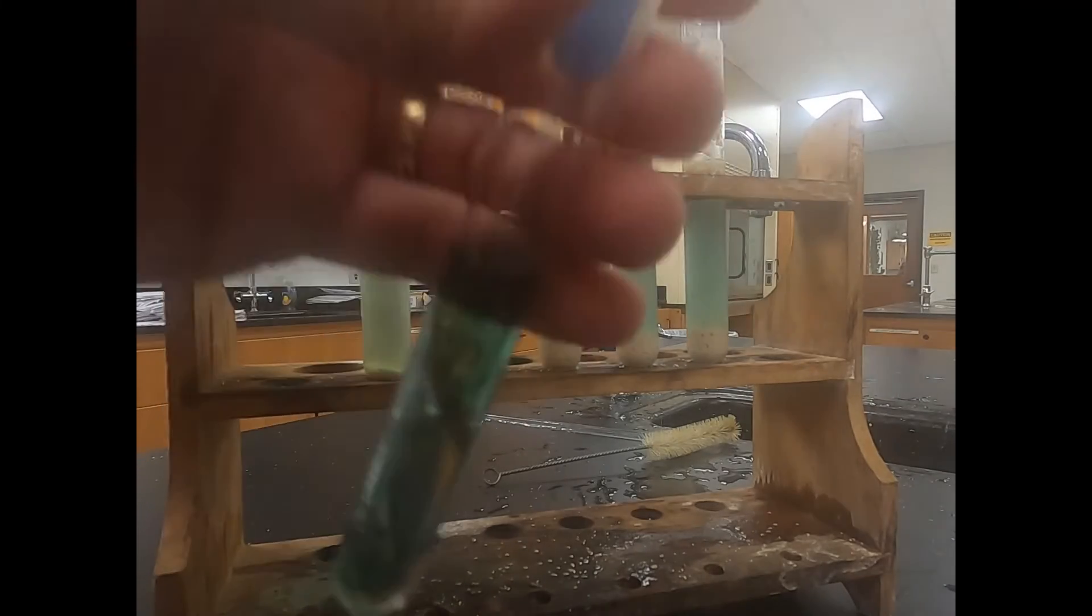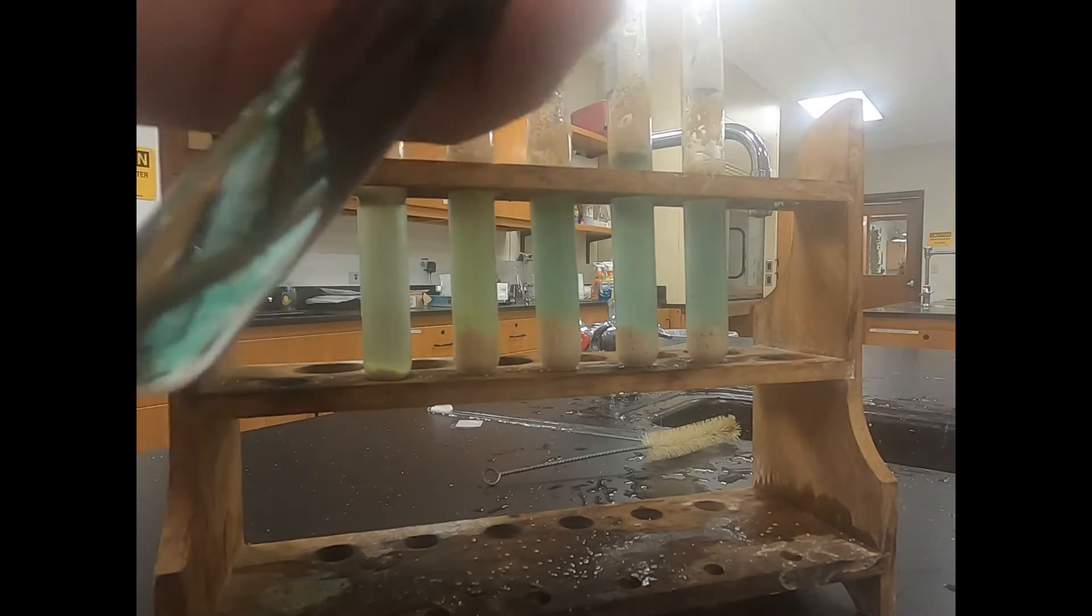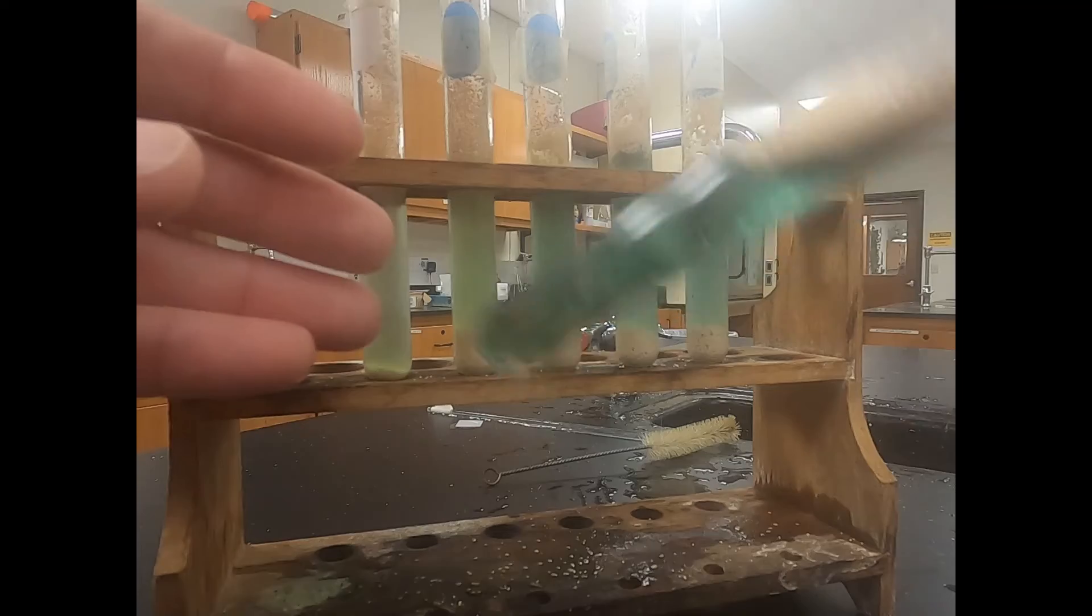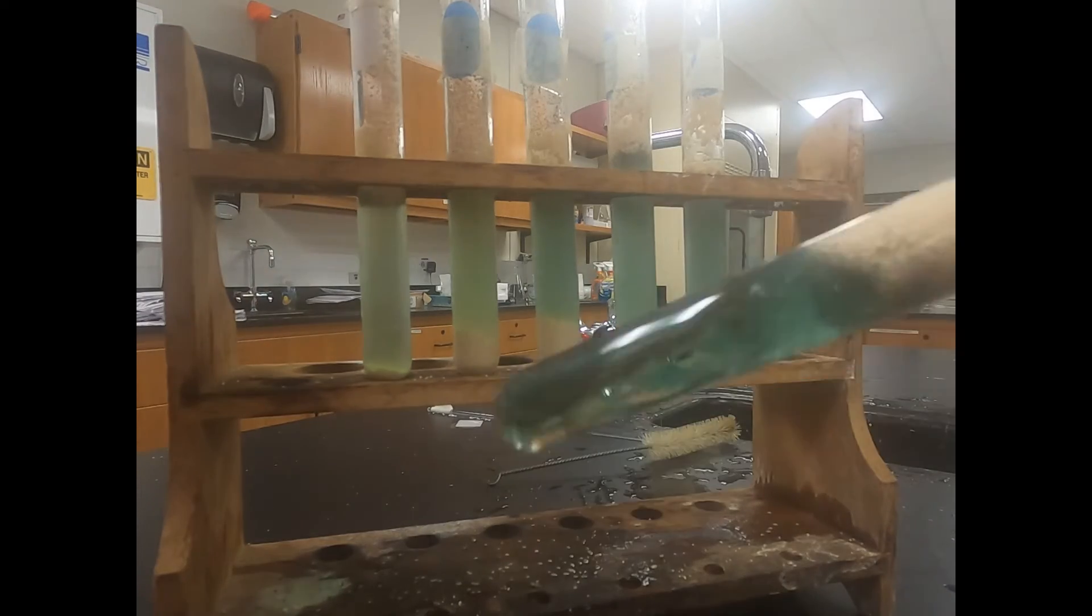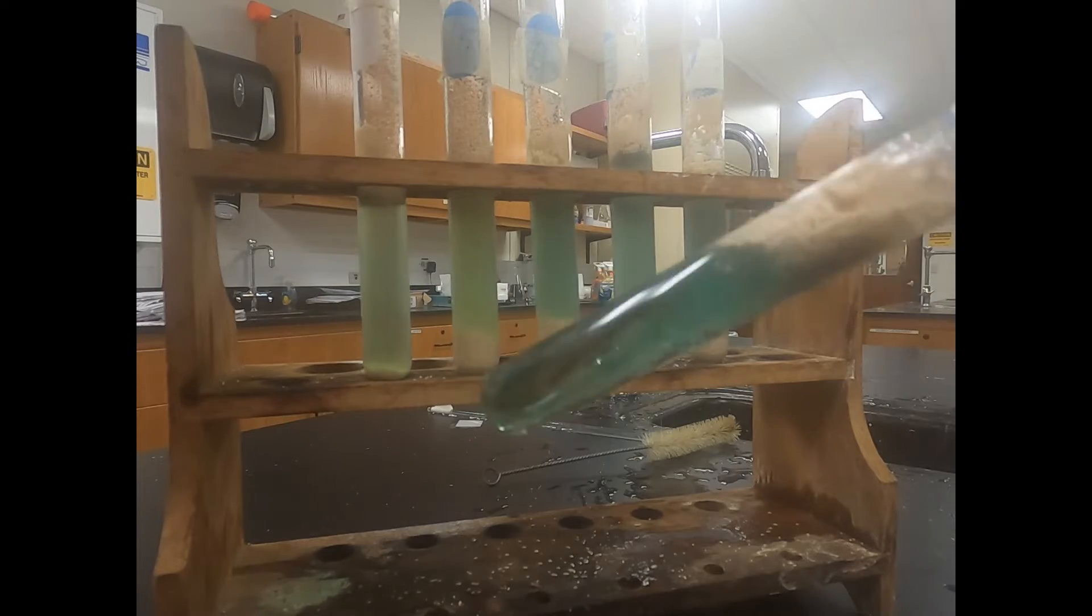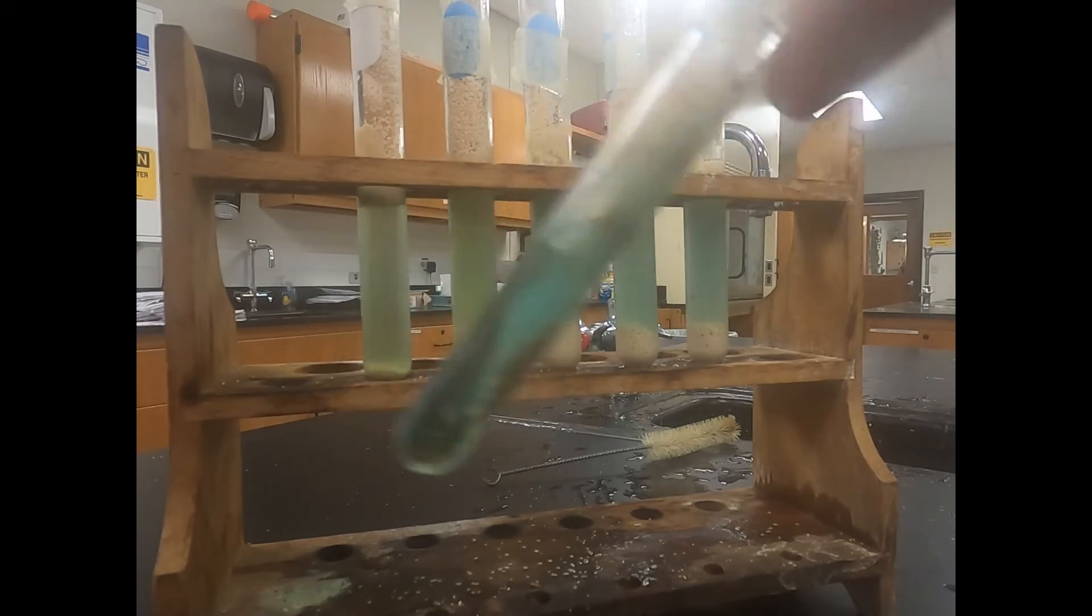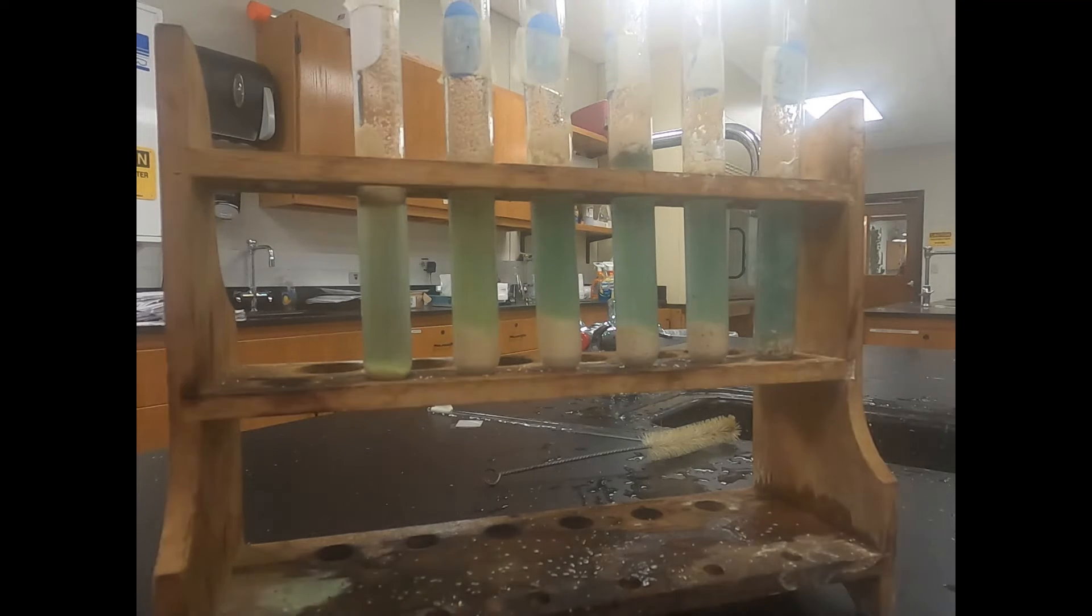Now we're adding yeast to our last test tube and again once we add it we do want to make sure we gently swirl it around. We don't want to be stirring it hardcore or anything but we do want to make it so it doesn't make like a seal on top of our liquid.